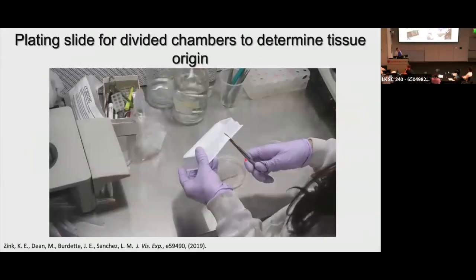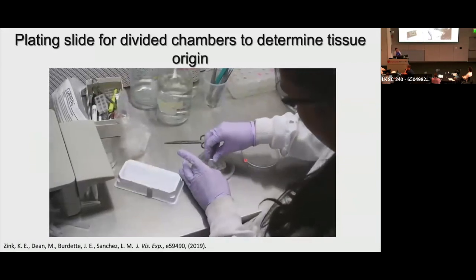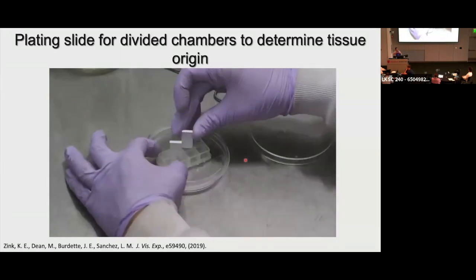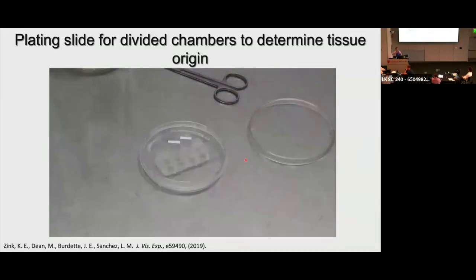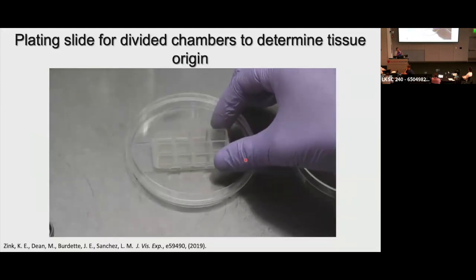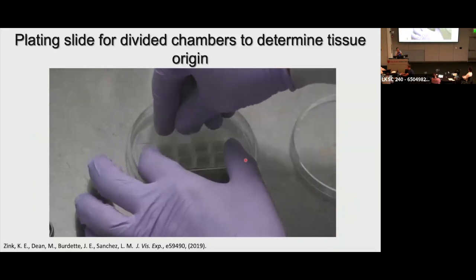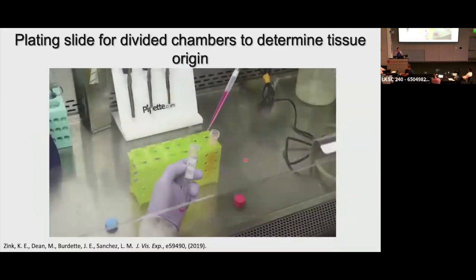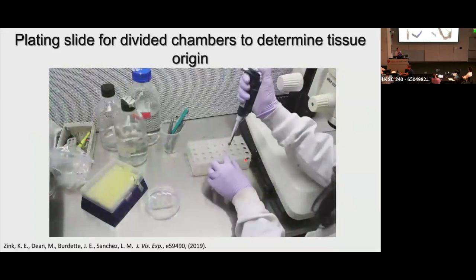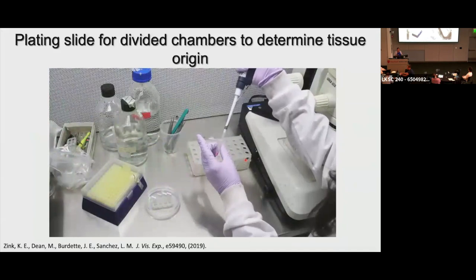And so what Catherine did was slightly redesign the same setup we'd been using. She took one of these sterile pipette media basins, then cut it so that we're now cutting these little chambers in half. And what she's going to be doing now is plating the cells on one half of the little divide, letting it dry, removing the divide, and then plating the other half of the co-culture. So we know that mammalian cells don't have the right machinery to actually move through the agarose, but chemistry can still freely diffuse through the agarose.